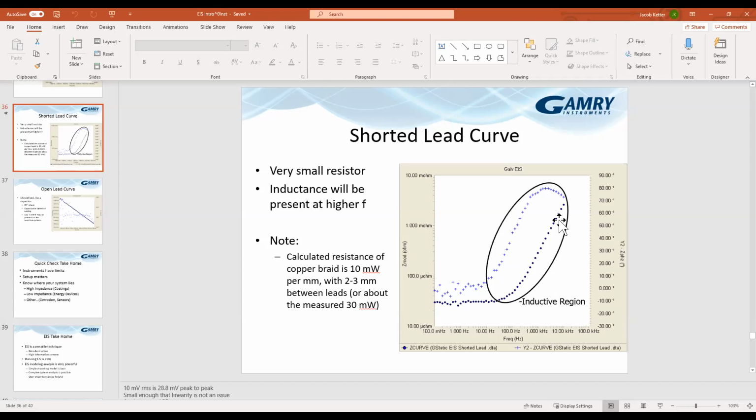This is dealing with CPEs again. How do we obtain capacitance in farads instead of the current units which we put out there, which are what, Siemens seconds raised to the alpha parameter?